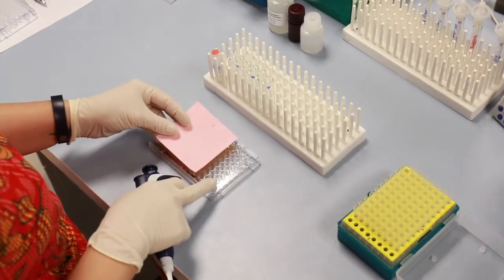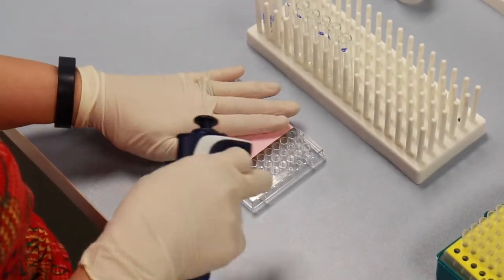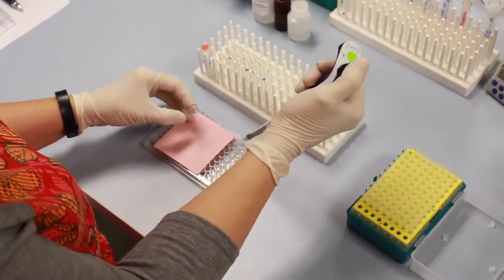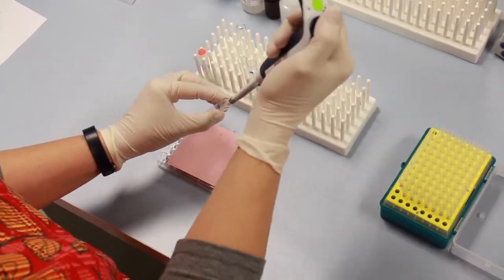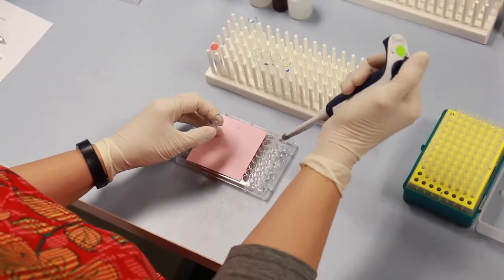When pipetting, it can be helpful to use a post-it note to line up which wells to use on a partial plate or as a guide for loading plates.